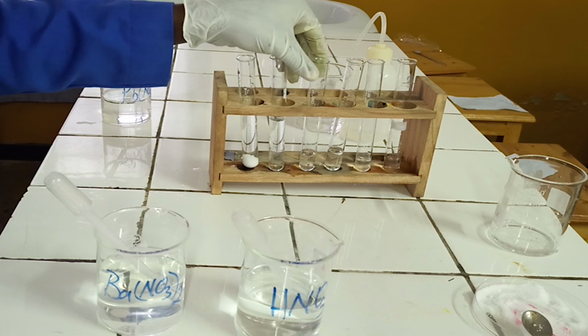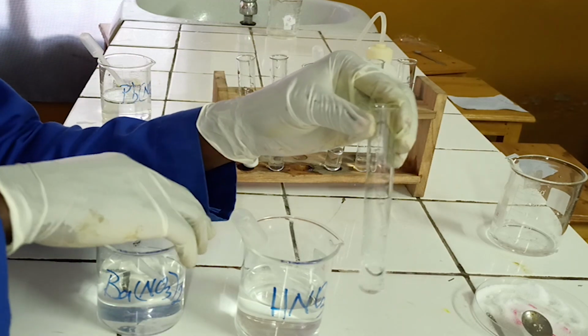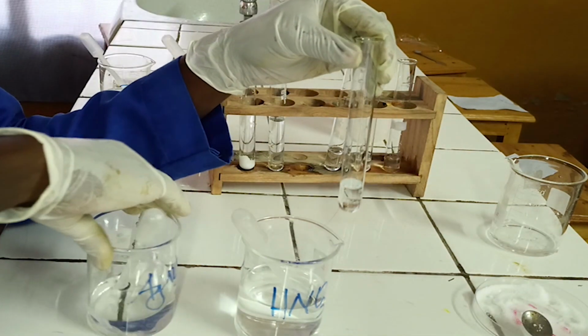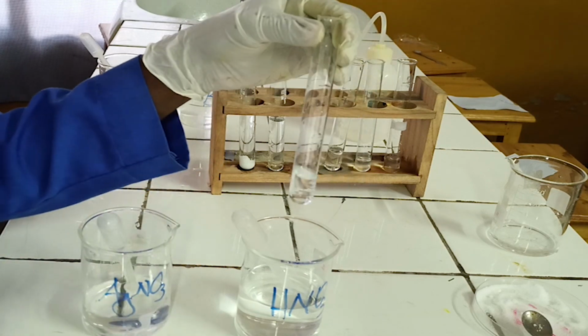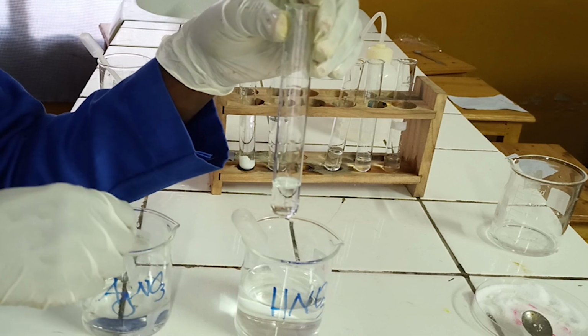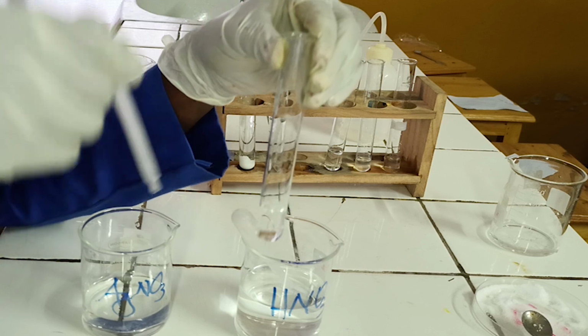Confirmatory tests. First confirmatory test. To the third test tube, add silver nitrate solution followed by diluted nitric acid.